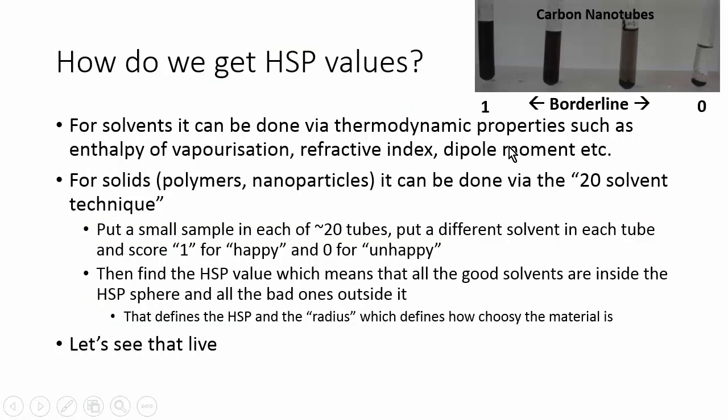And this also works for things like carbon nanotubes. So here I have a test tube with a solvent which really rather likes carbon nanotubes. The whole test tube is black. It's been sitting like that for weeks and months. I've personally seen these test tubes. They're from Dr. Simon de Trich in the University of Namur.